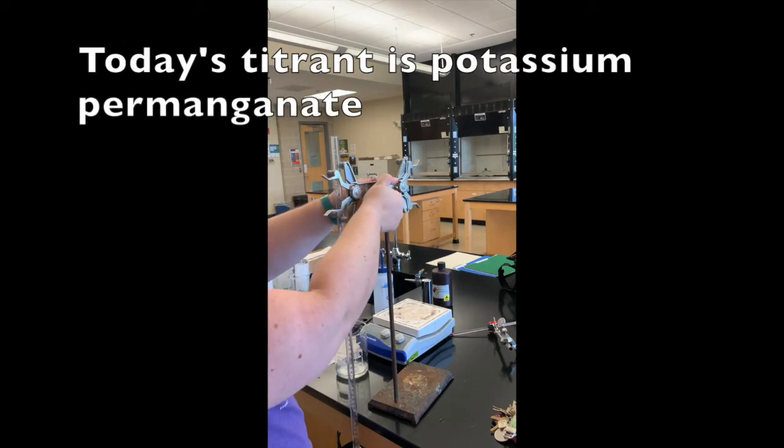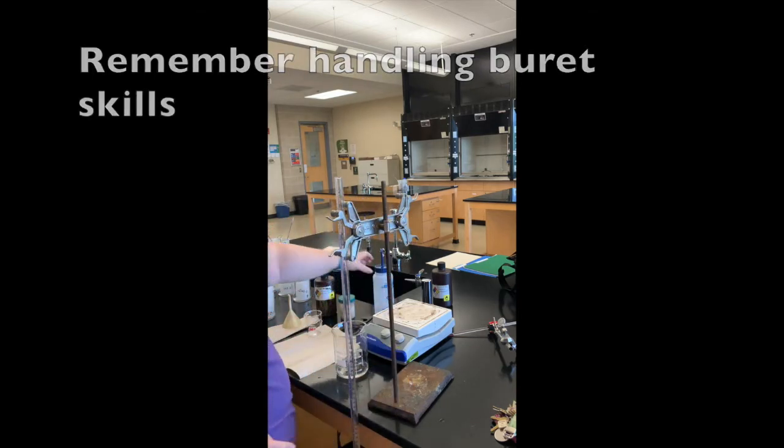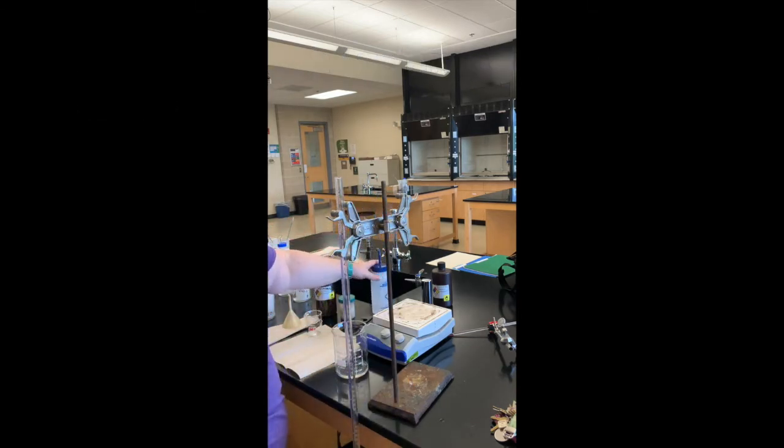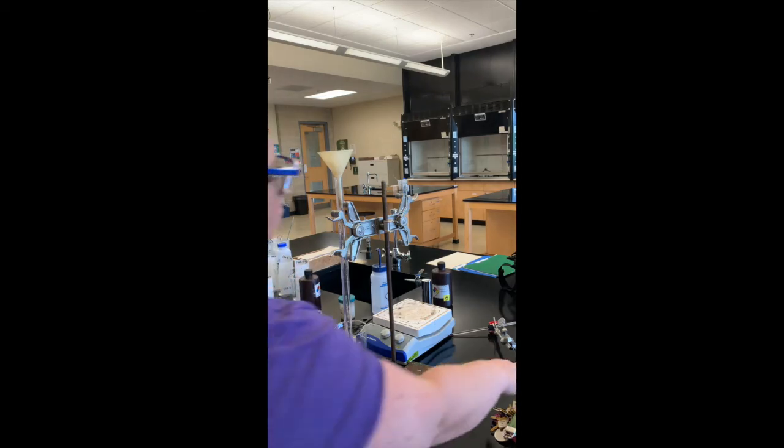Remember that you don't want to pour anything above your head, so I'm lowering it off the side of the table. I don't have a squirt bottle for the potassium permanganate, so I'm going to pour it into a smaller container and then use a funnel to put it into the burette. I'll clean it with potassium permanganate five times, just like I did with water.